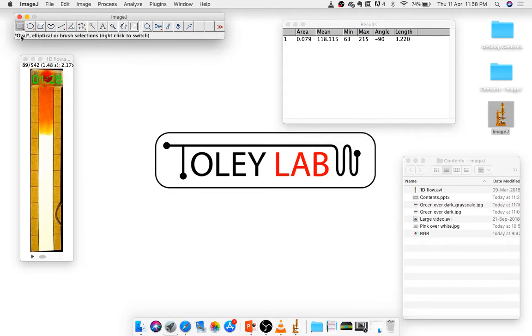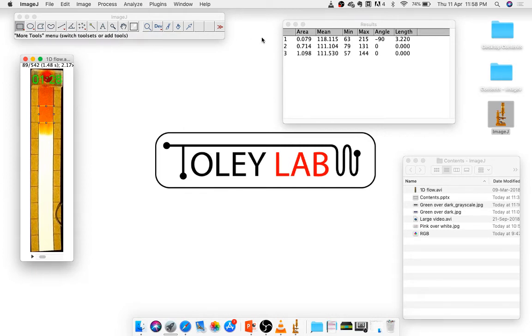So now what you can also do is you can make a rectangular selection, and if you do measurement, you should be able to get its area. So the area of this is 0.714 centimeters square. Let's try to make a square of 1 centimeter square area, and this should be reported as roughly 1 because the scale has been set. Okay, straightforward.